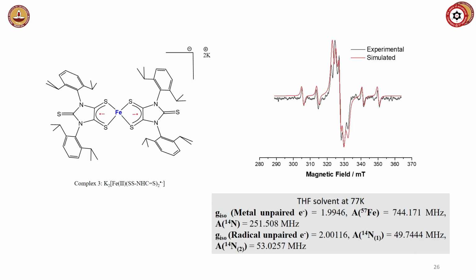These are our molecules: we synthesize them, make crystals, characterize them by X-ray structure, then record their EPR. And this chemistry is not so easy. Here you can see iron: this 6 signal in the middle is due to the nitrogen, and these other signals are due to the iron, and the difference between them is the coupling constant of the electron with iron.